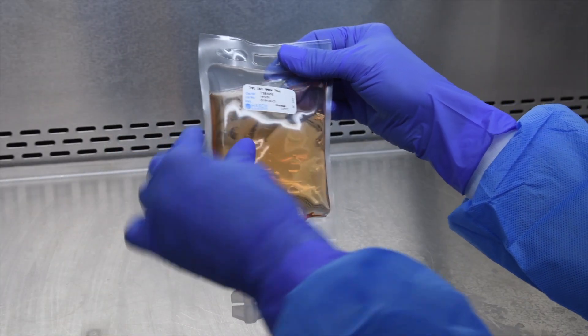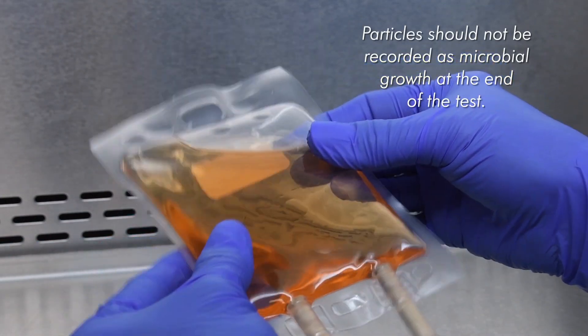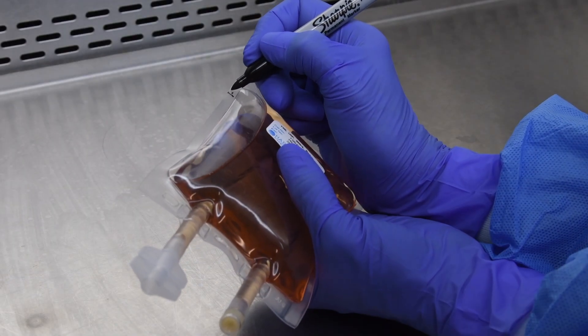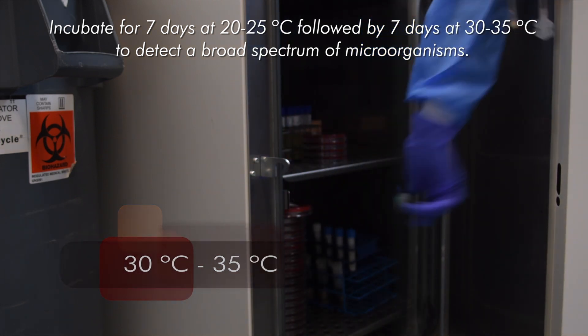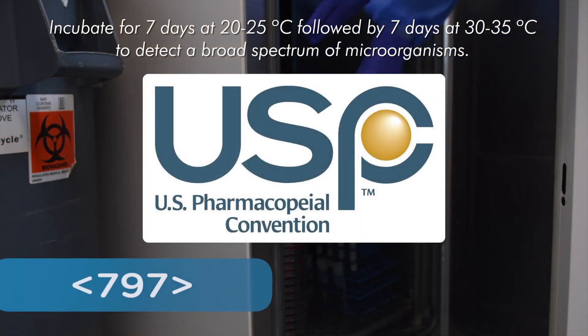Immediately inspect the TSB bag for visible particulates, corings, or fibers and note these if present. Label the TSB bag and incubate at 20-25°C or 30-35°C for a total of 14 days in compliance with USP 797.